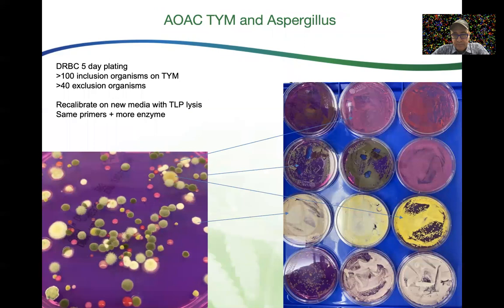Now, with that, we're taking those enzymes through the AOAC process. This is a process we're using to certify our yeast and mold test. What this means is we're taking a lot of organisms off of cannabis, sequencing them, and plating them on various mediums to see how well they grow, and then understanding how well they actually qPCR with our process, so that we can see if our qPCR properly correlates with these.